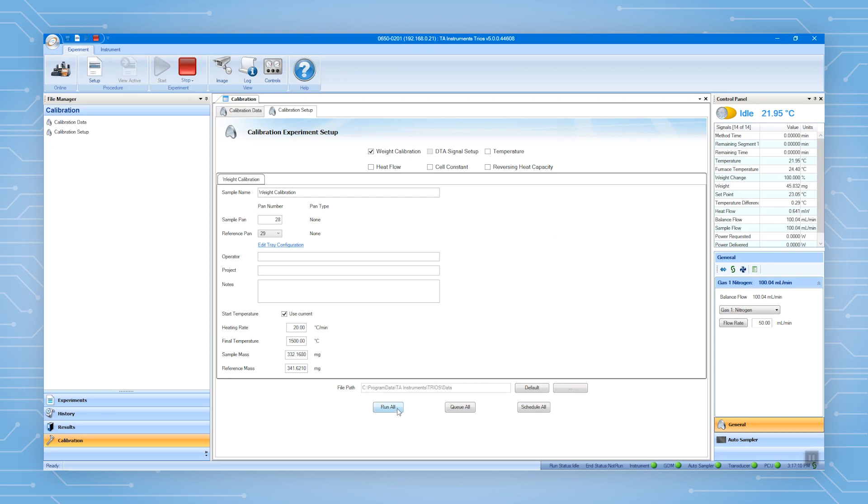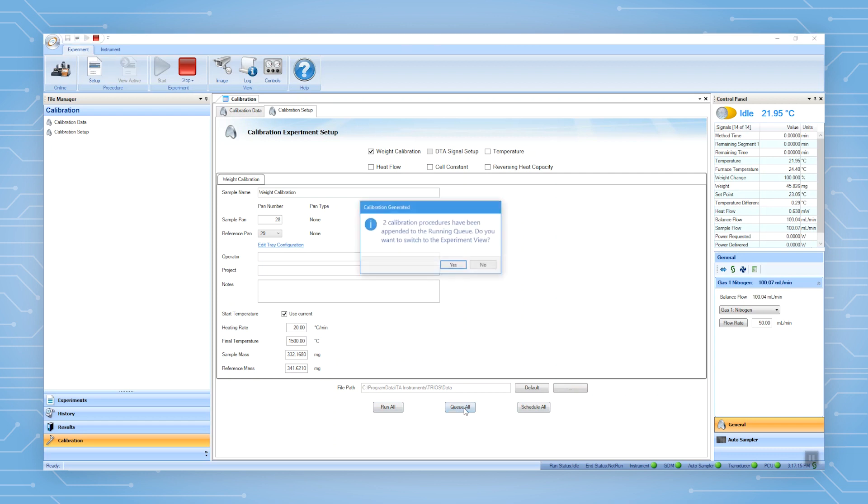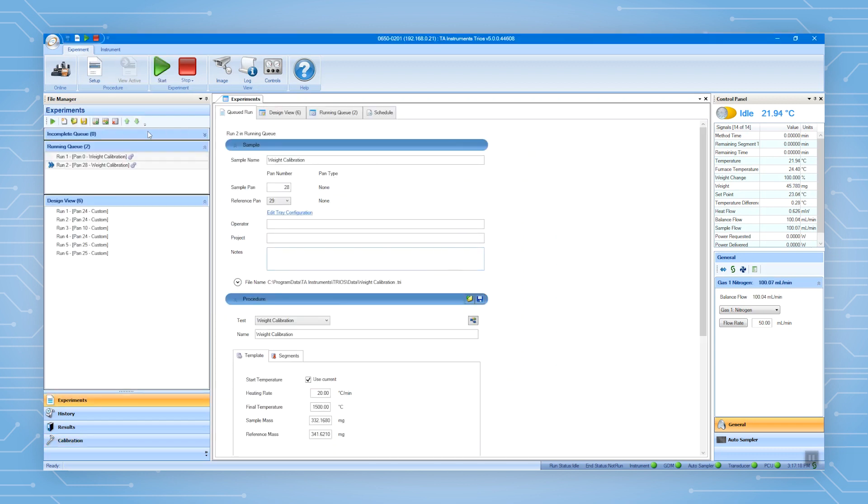If you have an auto-sampler, you can select one of the options here to start the calibration. When you queue the calibration, it will send the calibration runs to the experiment's view.